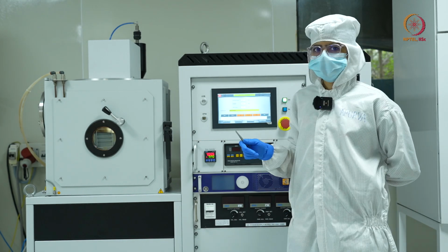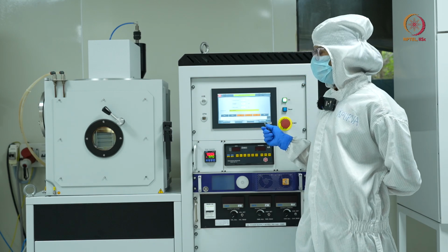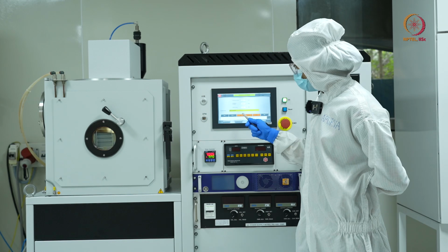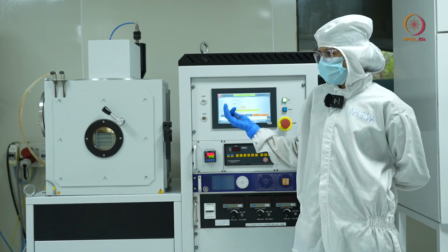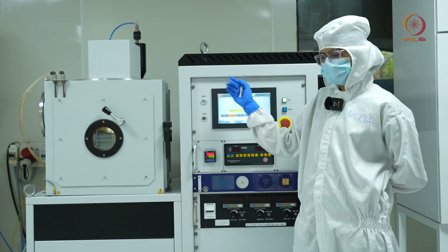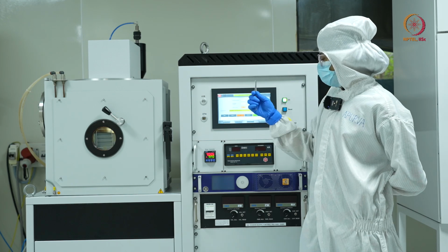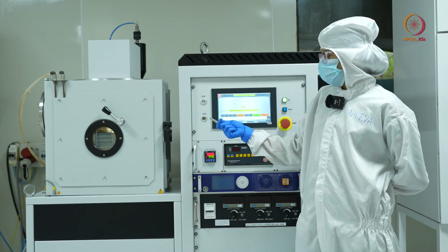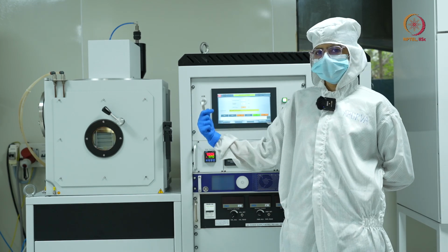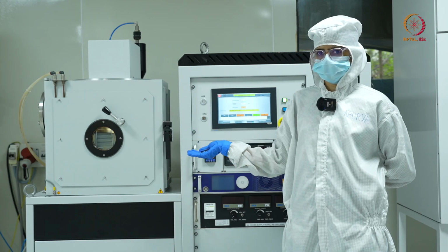It has been 4 to 5 minutes that we have put for cycling. Now it's time to vent the chamber and see how the deposition has come up. For that, first I'll press seal. What seal will do is it will isolate the chamber from the pumps, and then I'll press vent. Now you will hear a hissing sound. That means atmospheric air is coming inside the chamber and bringing the chamber pressure to atmospheric pressure.